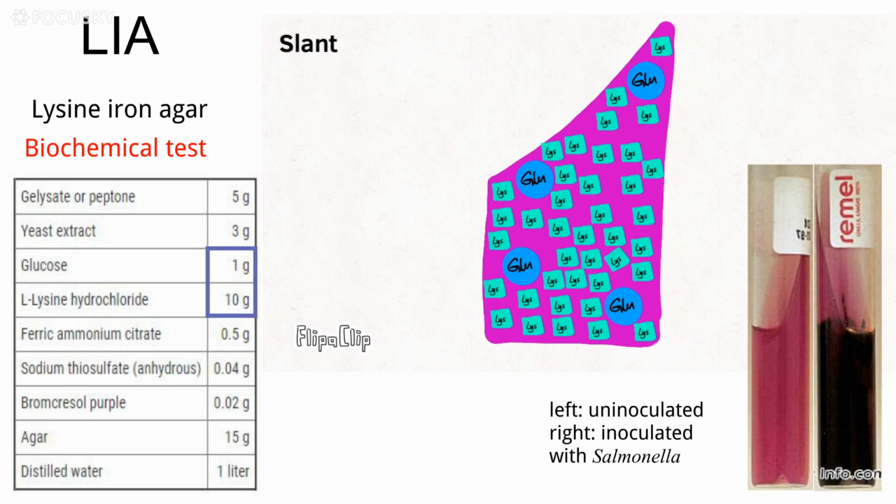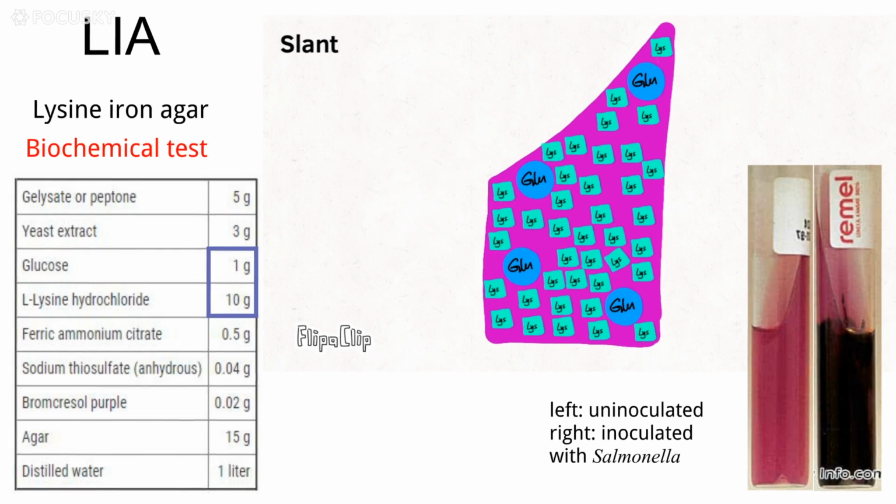You might see some cracks in the agar or the entire agar get pushed up due to the gas production as well.